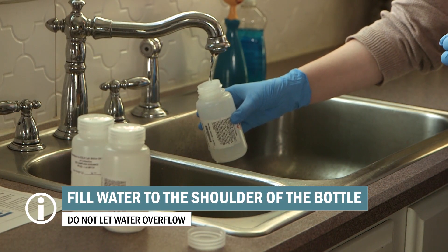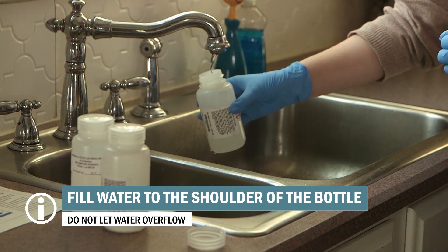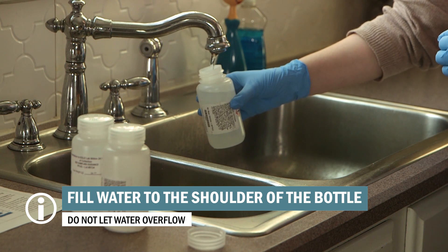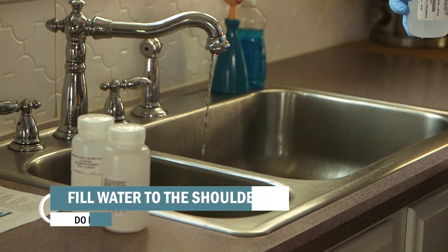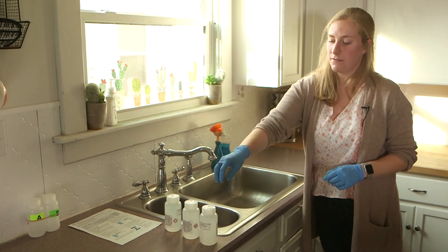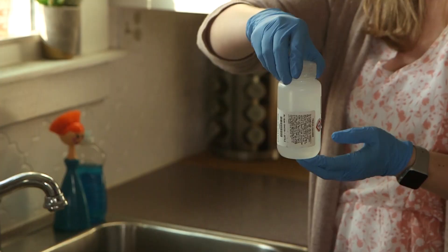Place the bottle under the stream of water and fill to the shoulder of the bottle. Don't let the water overflow the neck of the bottle because that will wash out the preservative inside. Once the first bottle is filled, screw the cap on tightly and then fill the rest of the bottles. You'll now want to flip each bottle upside down a couple of times gently to mix in the preservative.